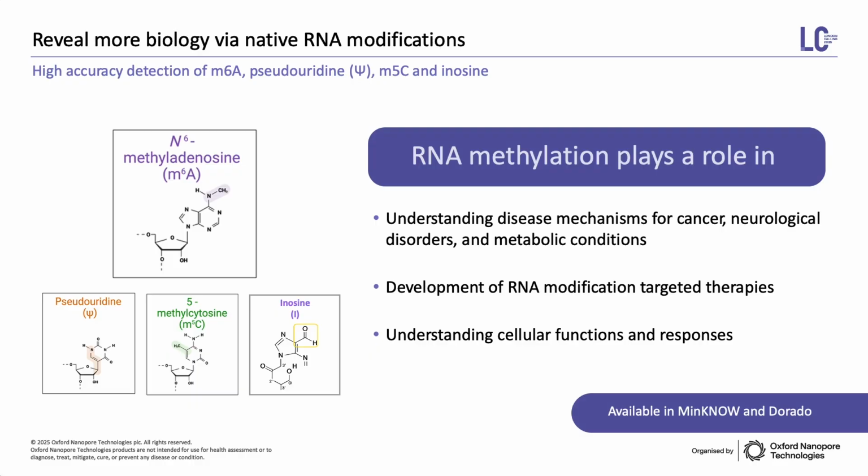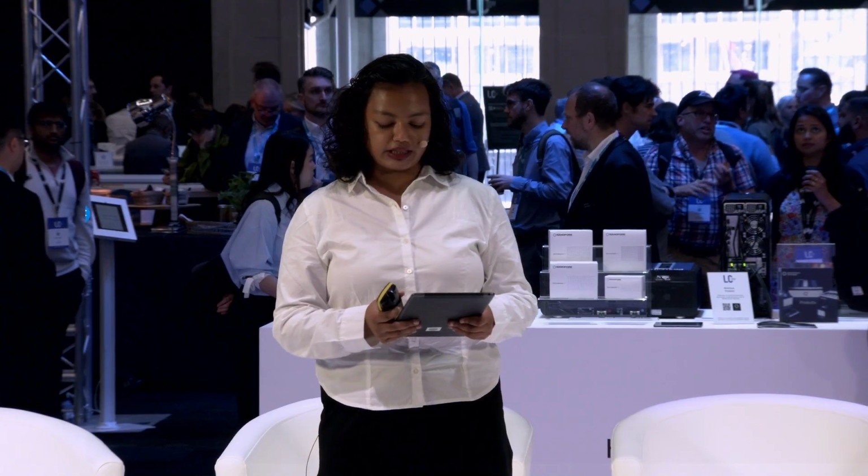So this workflow is available in real time through MinKNOW as well as Dorado, therefore empowering you to see the full complexity of the transcriptome as well as the epitranscriptome in a single run. So with that, we're going to move on to our Q&A session.